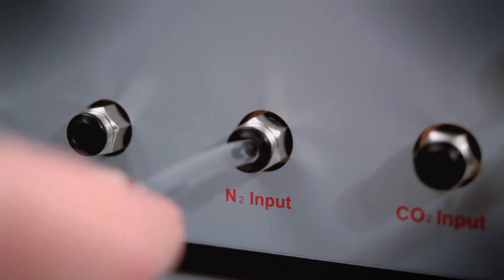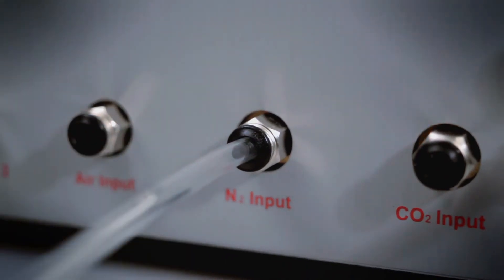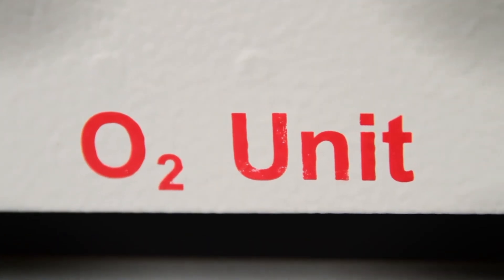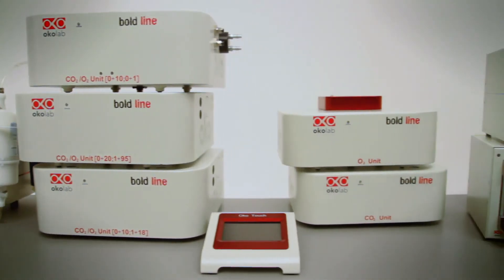Pure nitrogen and or oxygen are needed to feed the oxygen units depending on the specific controller selected.